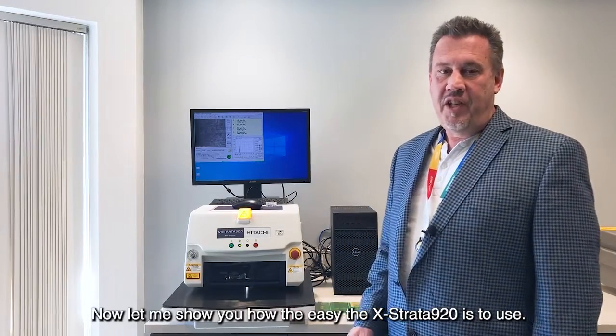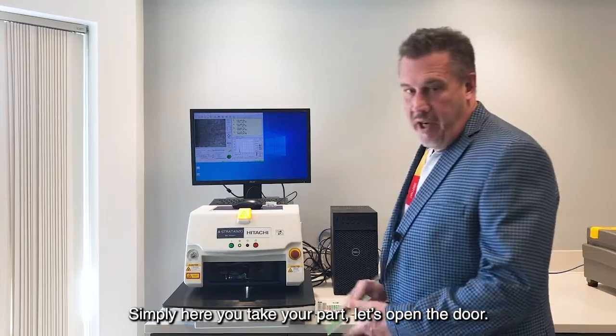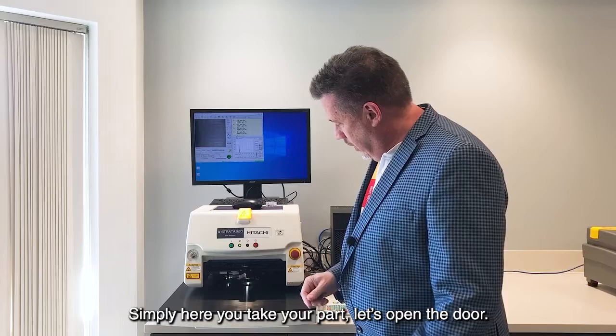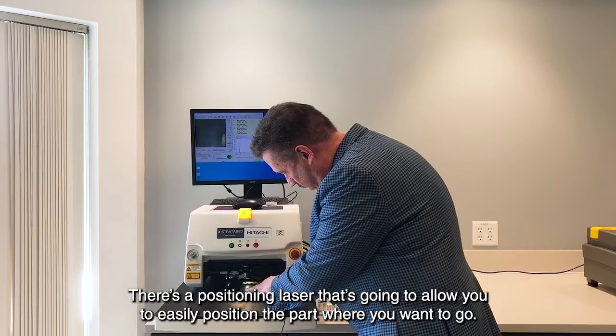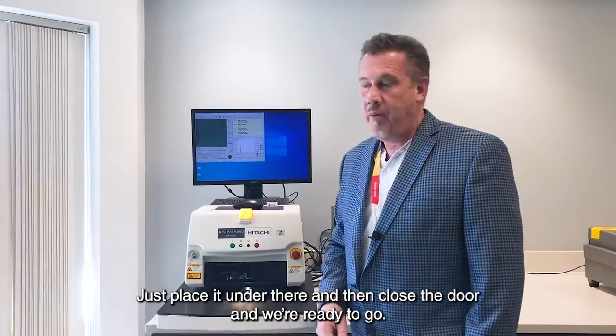Now let me show you how easy the Extrata 920 is to use. Simply take your part, open the door. There's a positioning laser that's going to allow you to easily position the part where you want to go. Just place it under there and then close the door, and we're ready to go.